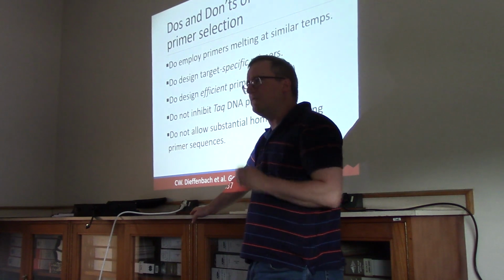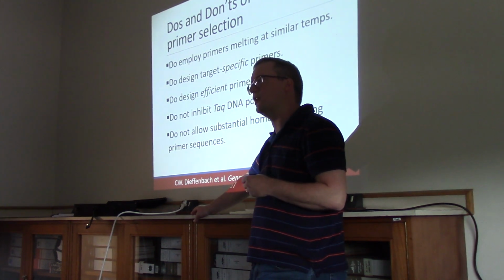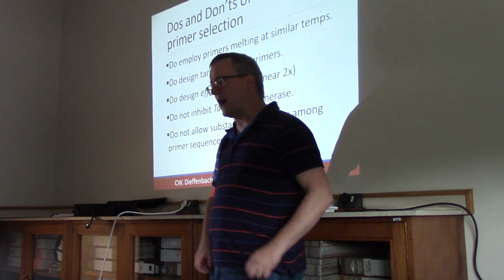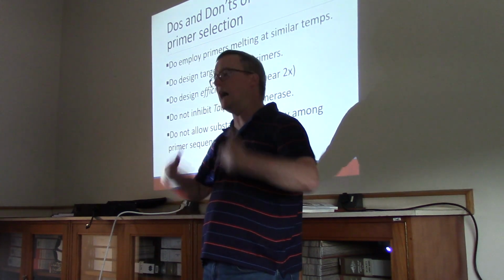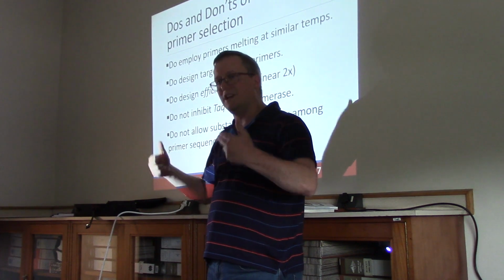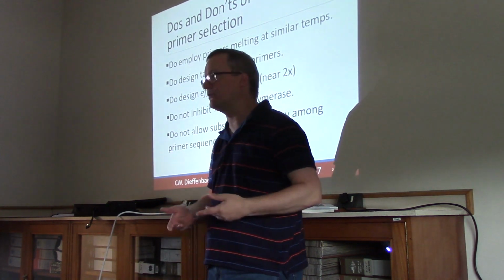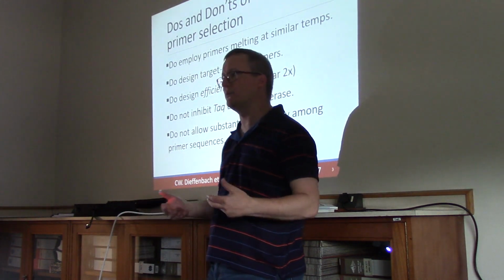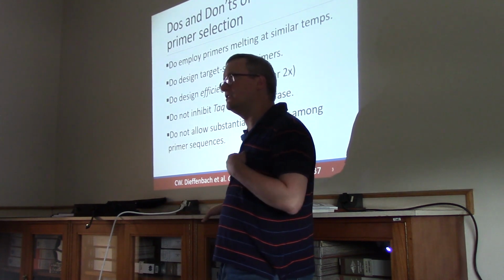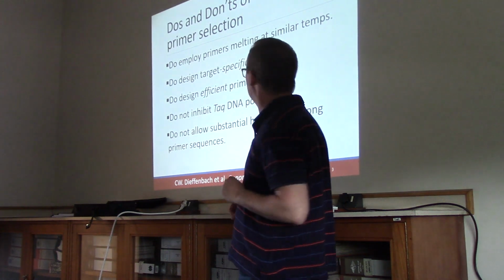So there are many competing goals that we're trying to accomplish in making PCR primers. Just to remind ourselves, our ability to amplify, to make many copies of a region, requires that we have a primer in the forward and reverse directions that bracket this area that we want to amplify out of a mixture. So the particularities of those sequences have many different goals to meet.